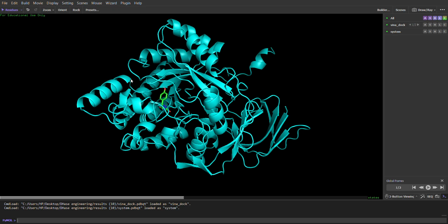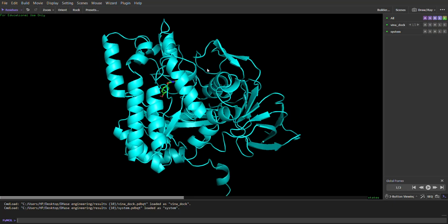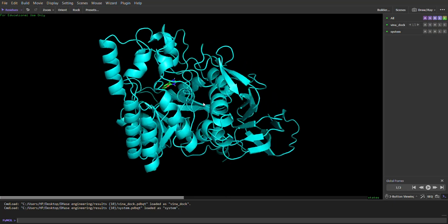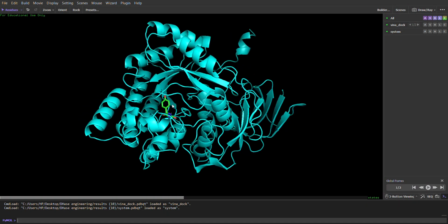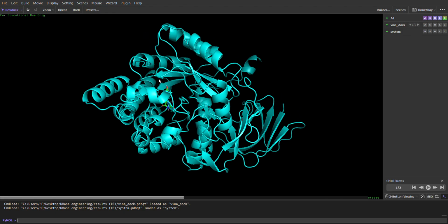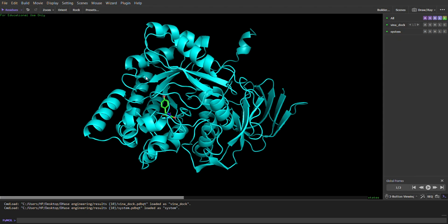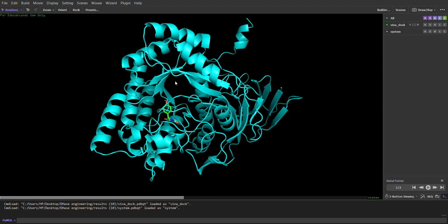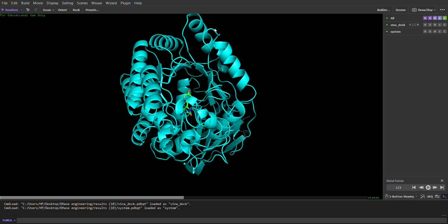And as I told you, I see alpha helices surrounding the cavity, the opening of the cavity, and I see that all these alpha helices are joined, some to beta sheets, by flexible loops. You can see this is a flexible loop joining this to this, and this is another flexible loop, this one joining this helix to this sheet.